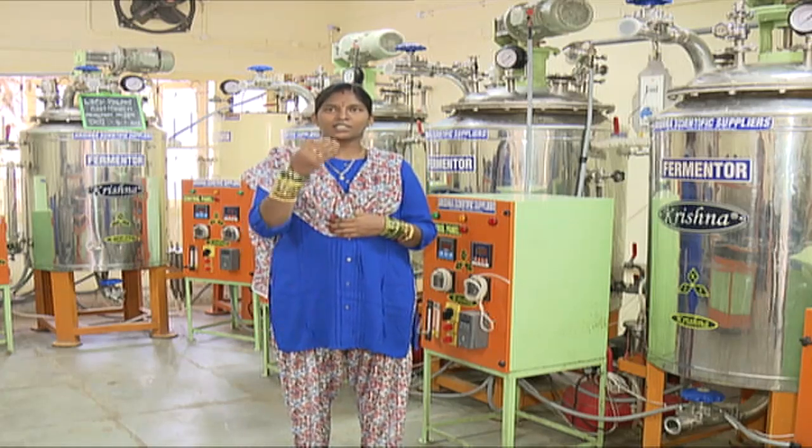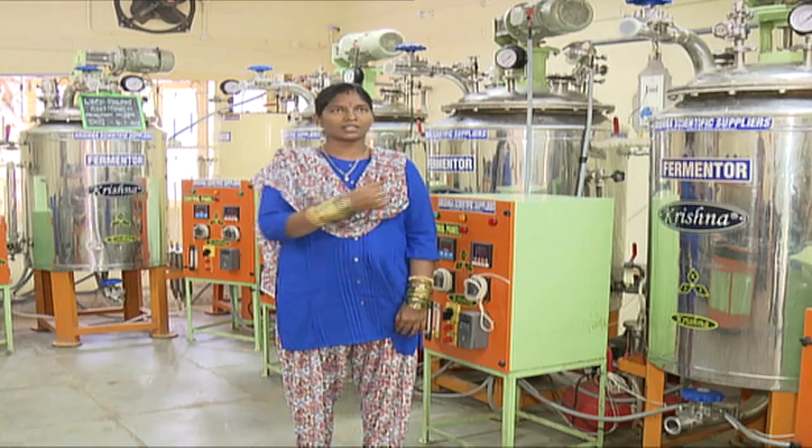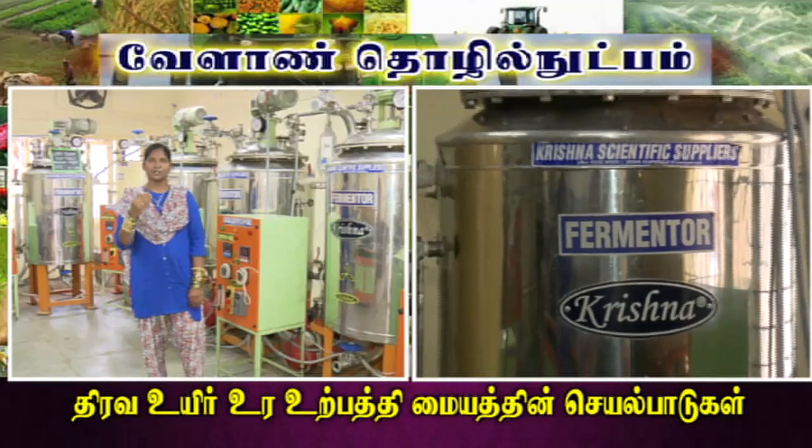First, in the mother culture, we are going to start a slant culture. From the slant, we are going to start a bottle culture. From the bottle culture, we are going to start a fermenter culture. This is the production procedure.